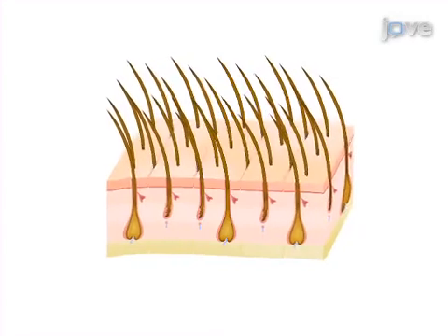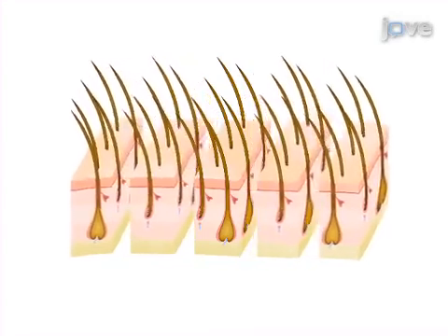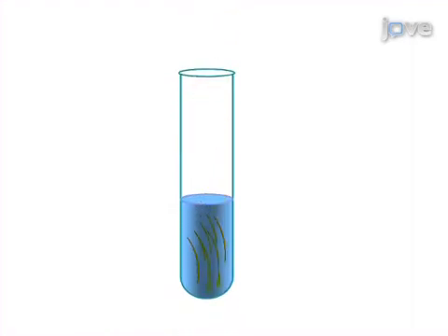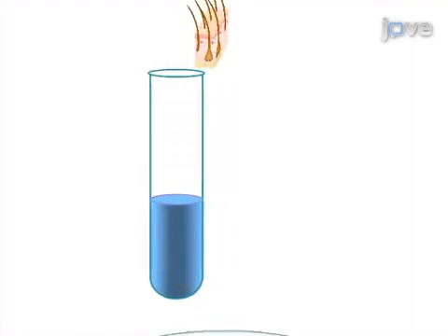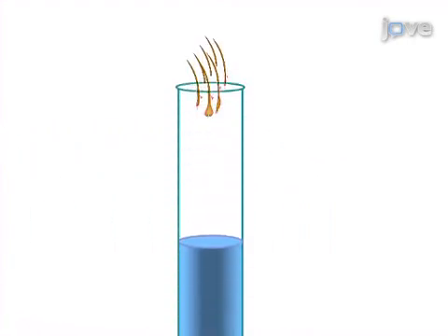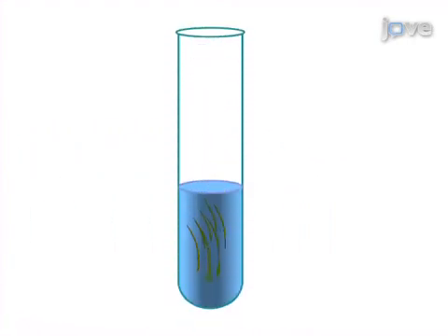This is accomplished by first cutting human scalp skin into 1 cm wide strips and incubating in media containing dispase. The skin is then arranged in fresh media and the hair follicles are plucked. The second step of the procedure is to treat the hair follicles with trypsin, and single cell suspensions are obtained.